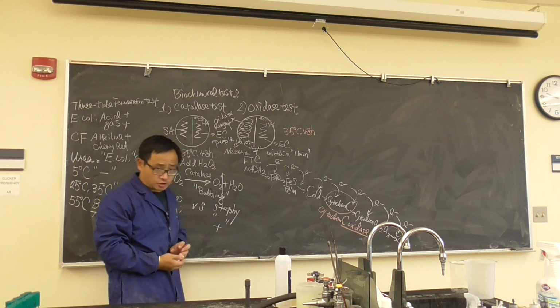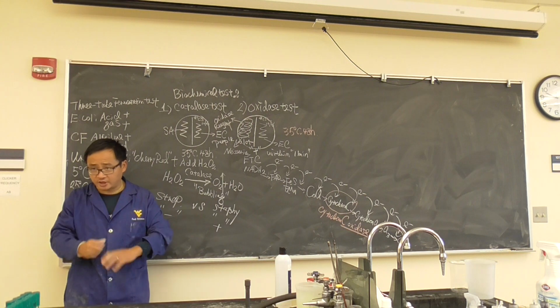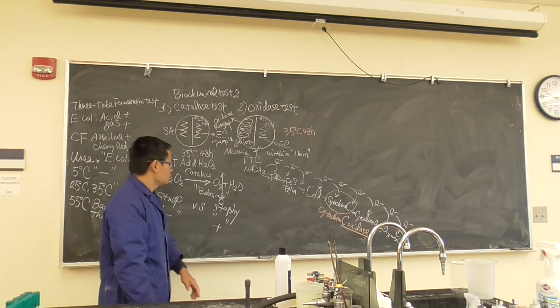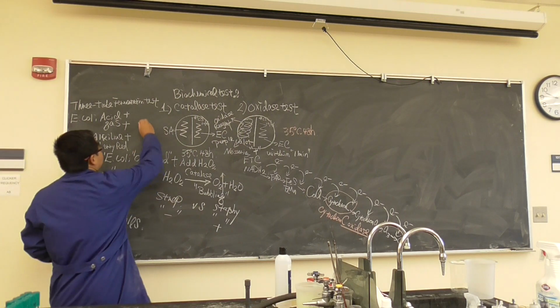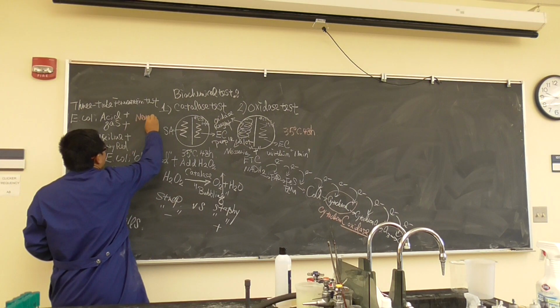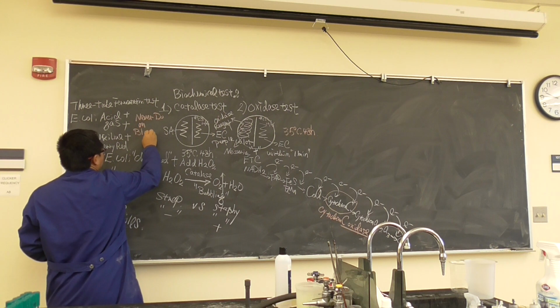Because there is oxygen existing in the air, if you wait too long, it's going to all become positive. Something I forgot about here: catalase test, never do on blood agar.